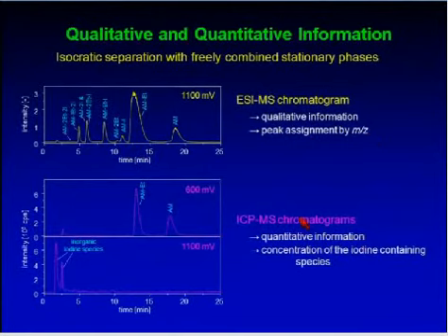If we now look at ICP-MS, and you should consider that the scales of the y-axis here are different, you see at a potential of 600 millivolts, so low potentials, mainly the parent compound and just the deethylation. While when you look at higher potentials, you see an almost complete mineralization of the compound, which is detected by the fact that you almost exclusively see the inorganic iodine species over here, which are iodide, triiodide, and also iodate.